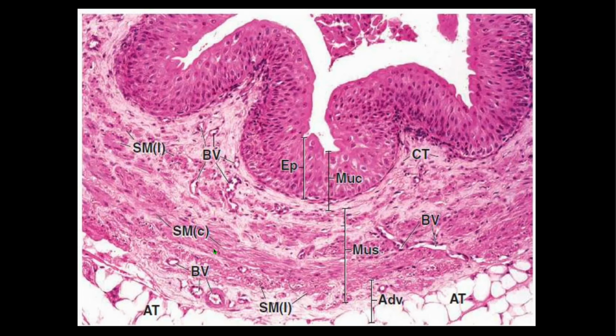In a cross section through the ureter, the inner and outer smooth muscle layers are cut in cross section, whereas the middle circular layer of the muscle cells is cut longitudinally. That's why there is the characteristic appearance in the figure. Now we are going to focus on this area to get a better understanding.